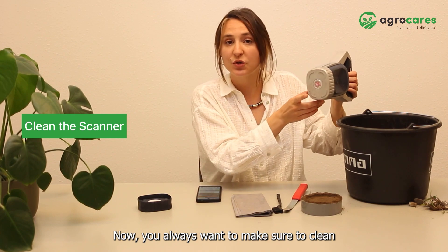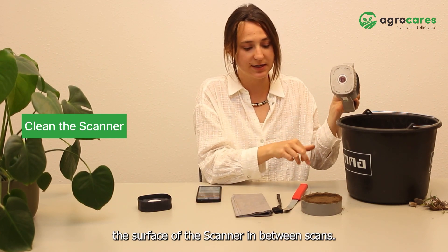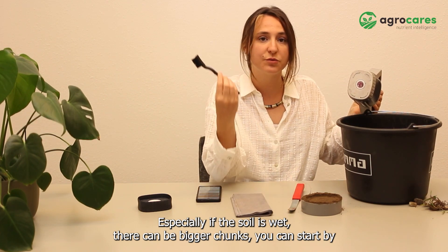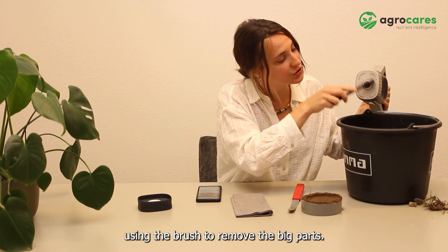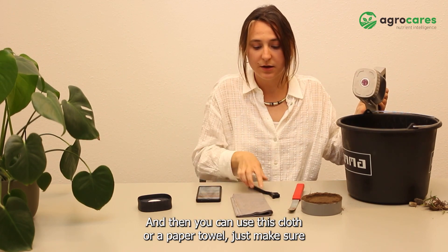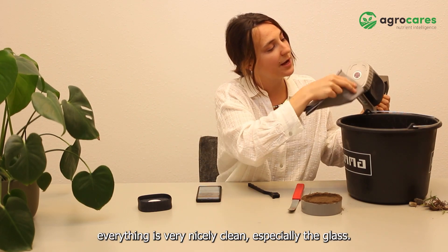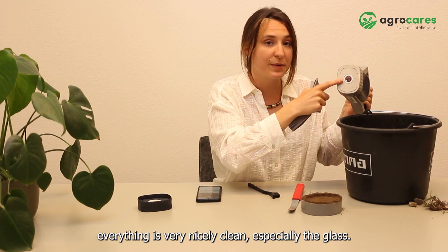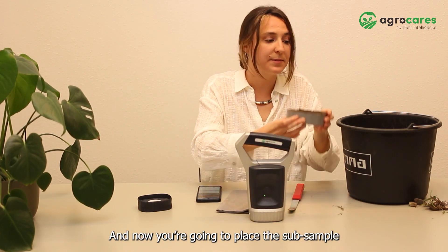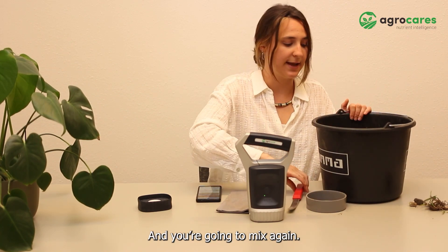Now you always want to make sure to clean the surface of the scanner in between scans. Especially if the soil is wet, there can be bigger chunks. You can start by using the brush to remove the big parts, and then you can use this cloth or a paper towel. Just make sure everything is very nicely cleaned, especially the glass. Now you're going to place the sub-sample back into the bucket and mix again.